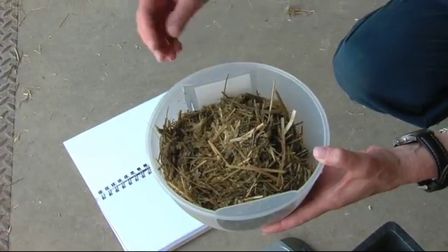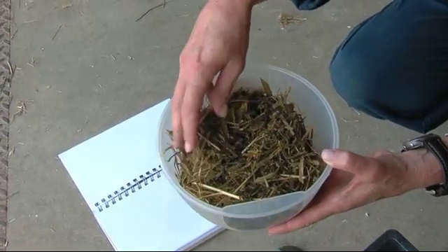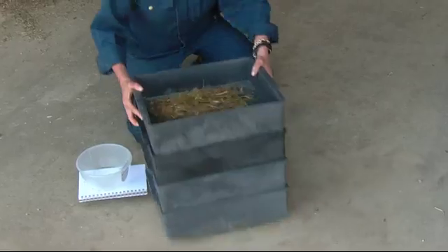I will take the sample and if it's too wet, I will often dry it out overnight just so that it shakes out better. Place the sample in the top of the shaker box and make sure that you get eight good strong shakes for each side of the box.